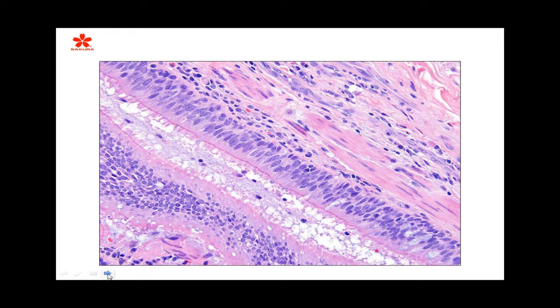Note, we really need to look critically at the nuclear detail. We really need to look critically at the contrasting cytoplasm and see what kind of grade we would give that. So this slide that I have here is what we would consider an optimal stain. Once again, it's all subjective based on the preference of your pathologist.